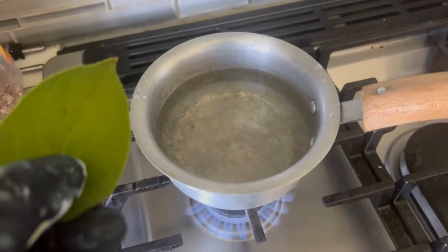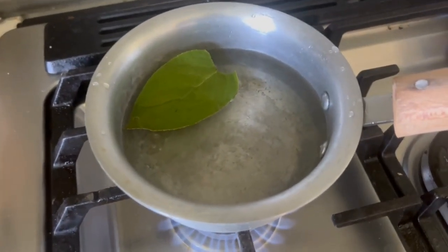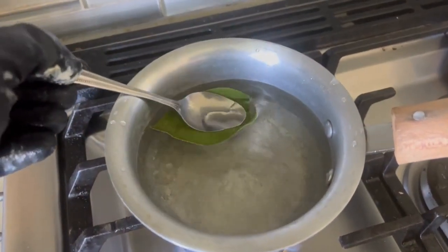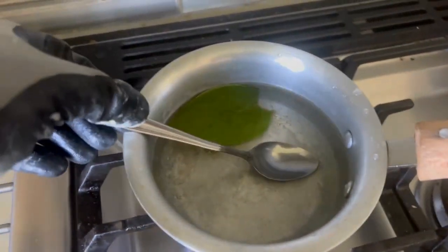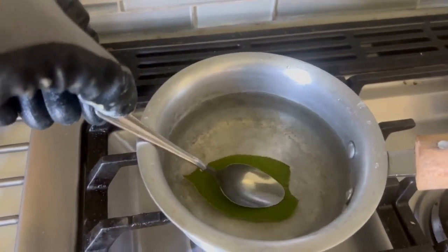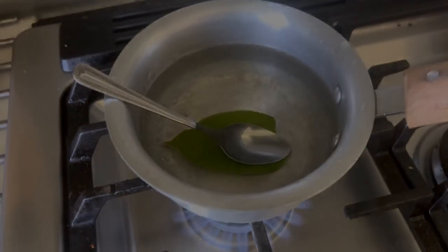Now we're going to be heating up the water and I'm going to carefully put the leaf in there. What I like to do — because I've done this experiment multiple times — is get a spoon and weigh it on the leaf, letting it sit on the leaf so that the leaf is fully submerged. And now we're just going to wait.